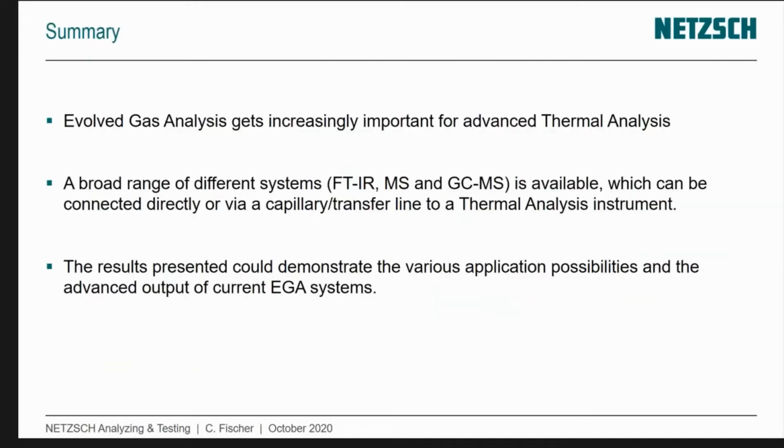In summary, evolved gas analysis is becoming increasingly important for advanced analysis of thermal analysis. A broad range of different systems like FT-IR, MS, GC-MS is available, which can be connected directly or via a transfer line to a thermal analyzer instrument. The results presented could demonstrate the various applications possible and the advanced output of current evolved gas analysis systems.